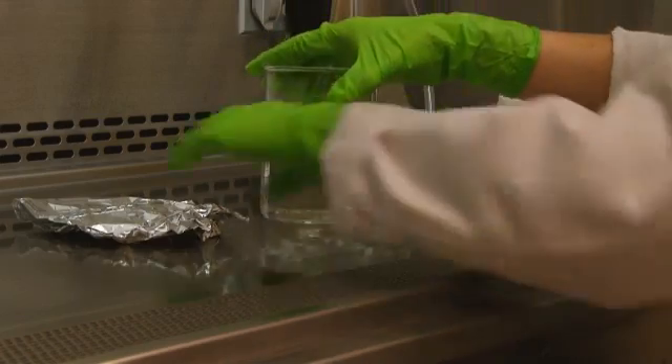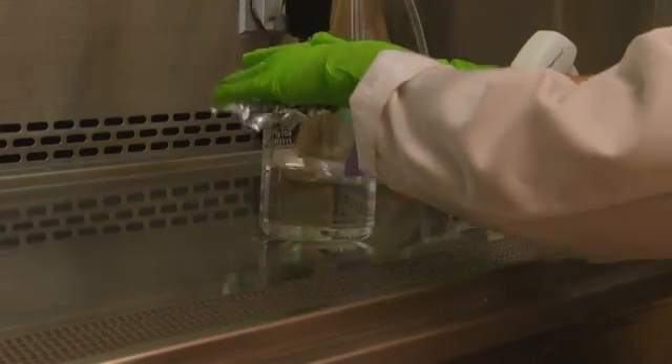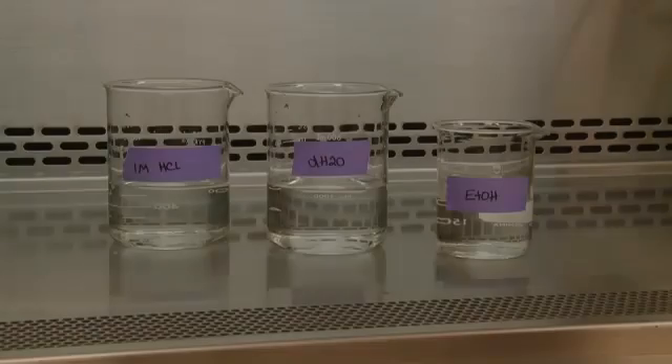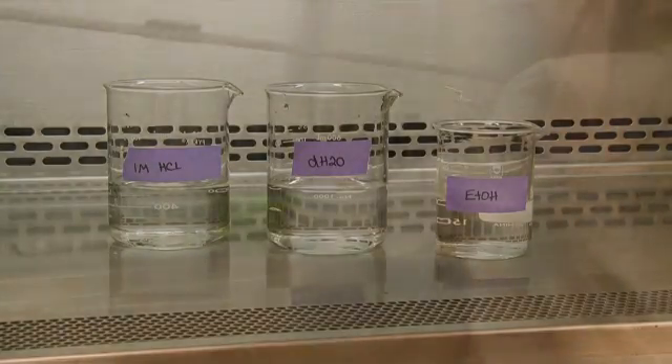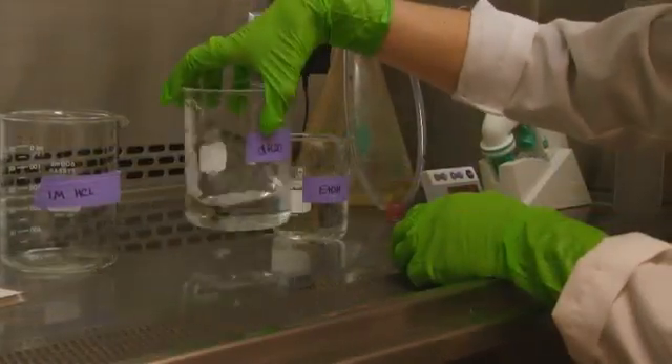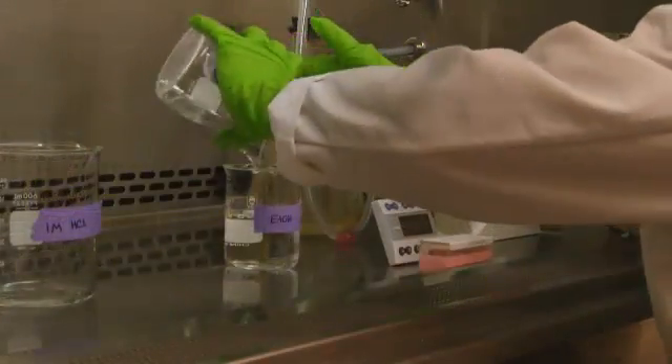We begin by acid-treating new cover slips in 1 molar hydrochloric acid for 24 hours. After carefully decanting off the acid and removing the glass cover slips, we wash each with distilled water, then a final rinse with ethanol.